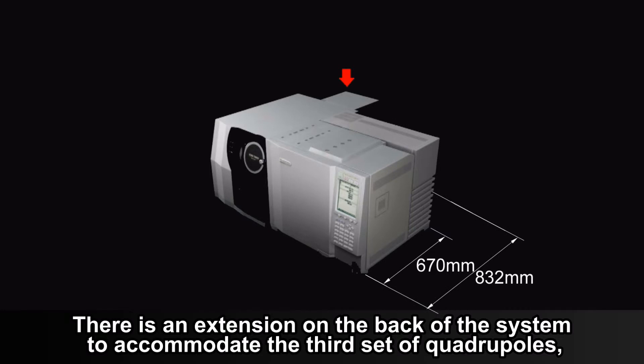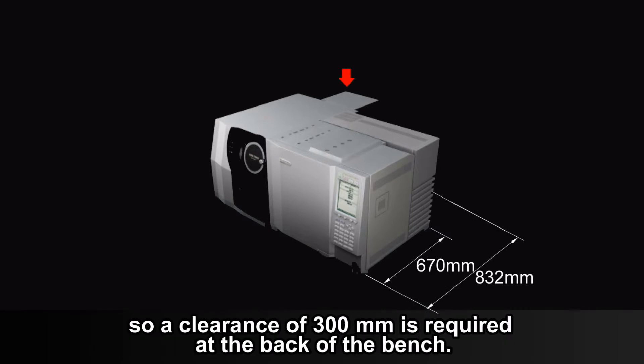There is an extension on the back of the system to accommodate the third set of quadrupoles, so a clearance of 300 mm is required at the back of the bench.